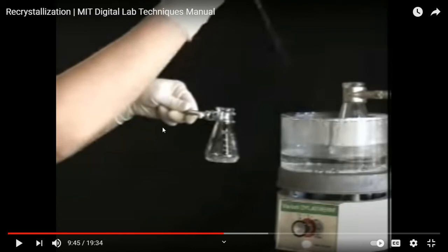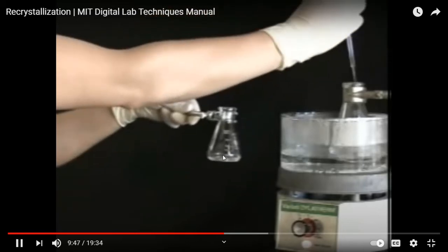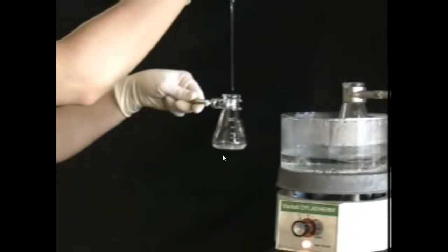So yeah, I am trying to give you the best, but they have their own ways of reducing risk. At this point, add a small amount of hot solvent to redissolve the solid. When your sample is once again dissolved in the minimum amount of solvent, set it aside to cool.